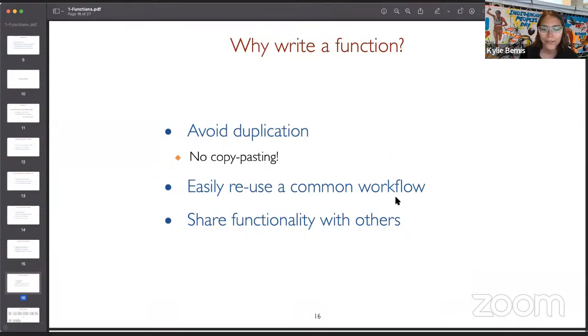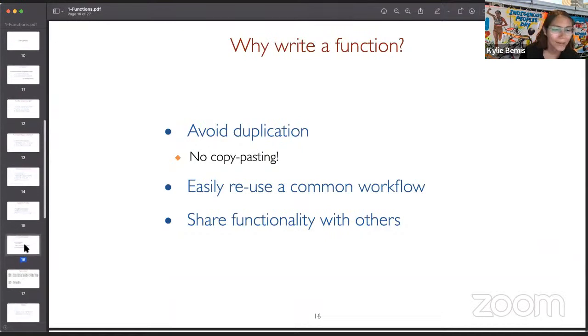All right, great. So it looks like we have a number of people who are not very experienced with writing functions. That's great. So we'll learn something already. All right. So think for a moment about why you might want to write your own function in the first place.